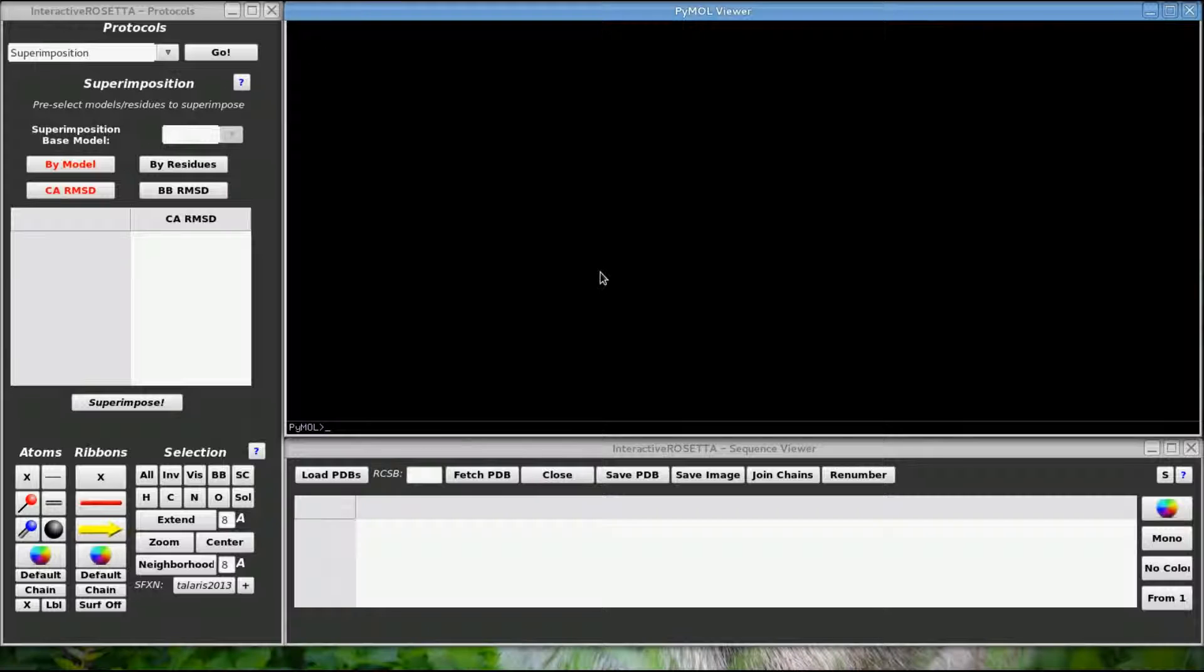I am running Interactive Rosetta on a Linux system, but everything will be the same for Windows and Mac users. The styles of the controls will be a little different.